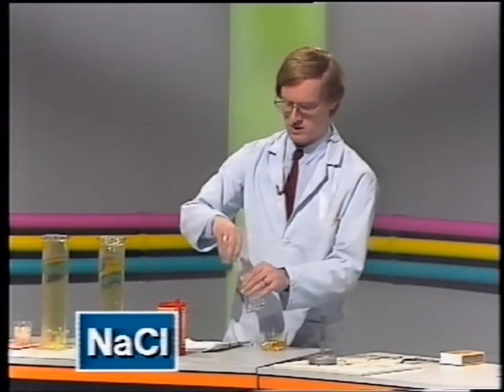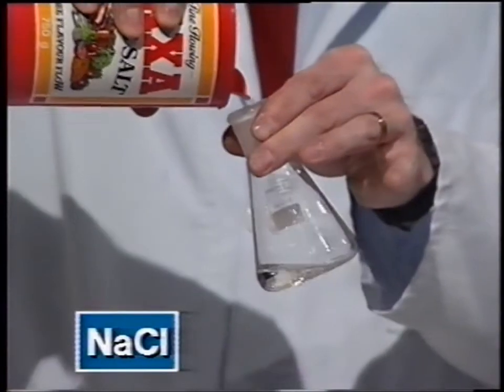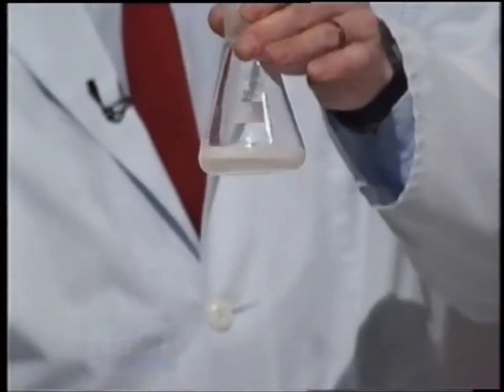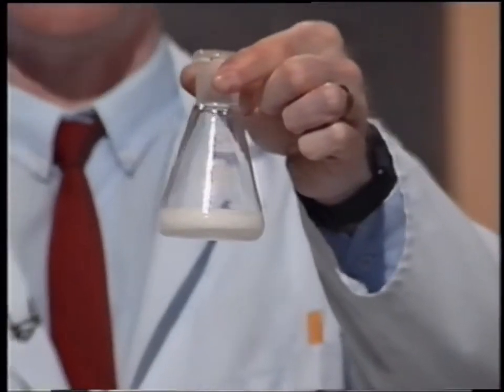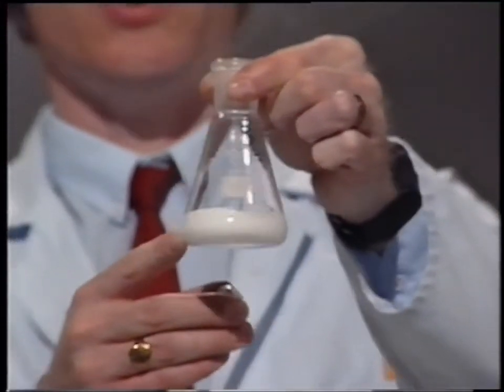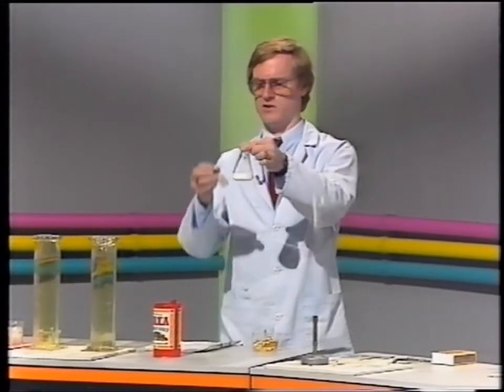Salt can be turned into other useful chemicals. It's useful as itself, but it can be turned into other useful chemicals, and I can show you that reaction here, producing what's sometimes called salt gas, but its chemical name is hydrogen chloride. This gas you can see forming steamy fumes as it comes into contact with the air.